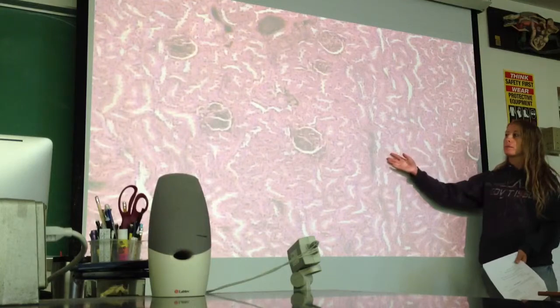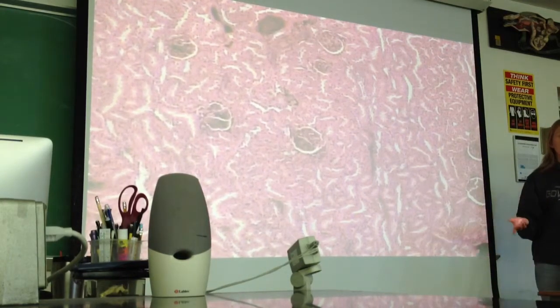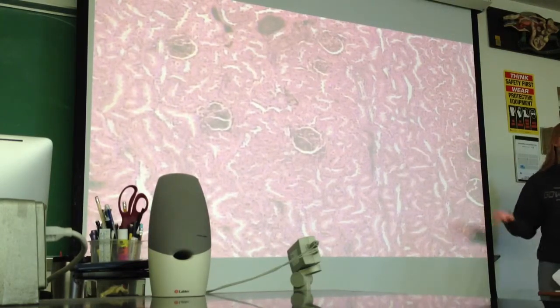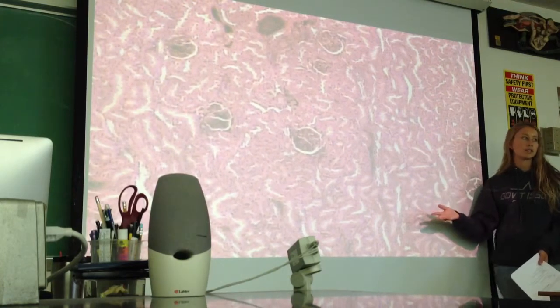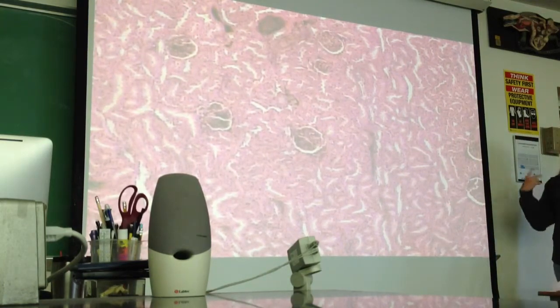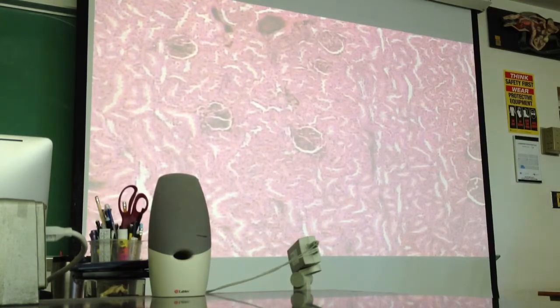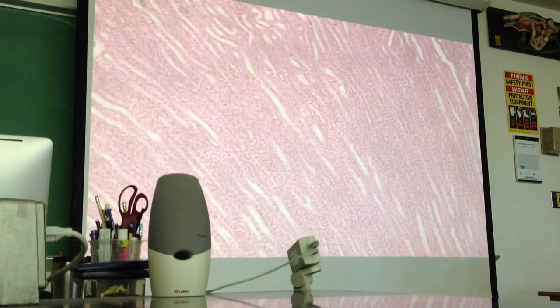If we were just to put this slide up and ask you to identify the layer, this isn't one that would necessarily need a pointer. We would be asking for the cortex. If we're asking for the whole slide, we're asking for the kidney. Those are the levels of organization that we're going to be addressing with this. One last bit for comparison: here's medulla, nice, straight nephron tubules.